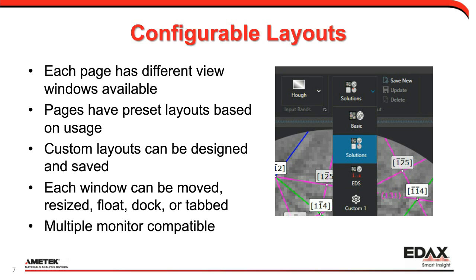So this harkens back to the original title. Basically, you can configure your workspace how you want to see it, how you want to operate.